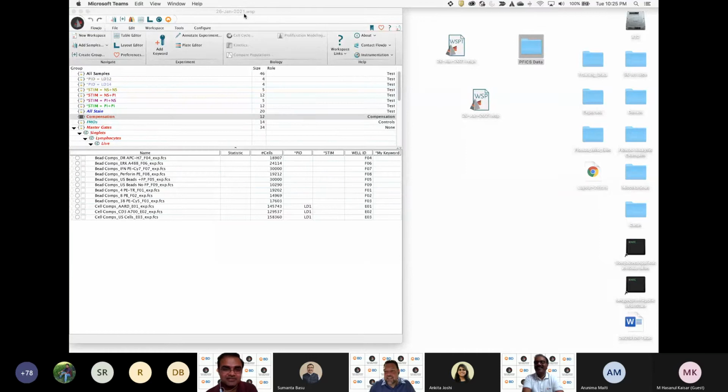Thank you all. So we have how many more questions? Three for this break. Yes, the second question is live now, Amlan. Okay. Yeah, so let me read out the second question. Is this the one? Table editor and layout editor in FlowJo? Yeah, so there's been a typo. I think we have shared the correct answer, so we can move with the next. If we have any discussion we want to do over it, we can do, but the answer is already written there, so that's a typo from us.